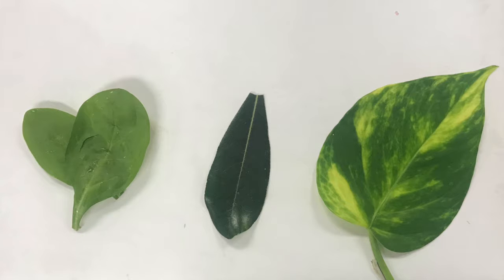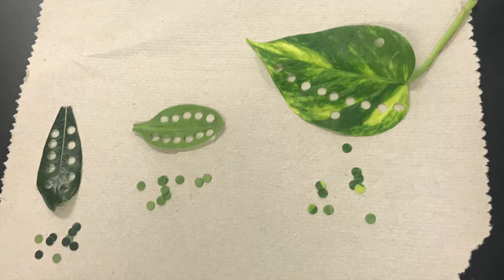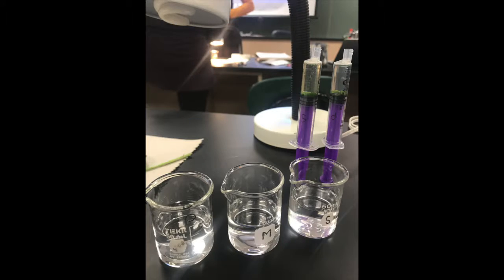Obtain 3 leaves: 1 myrtle leaf, 1 philodendron leaf, and 1 spinach leaf. Next, take a hole punch and punch 10 discs from each leaf. Next, fill 3 beakers with 30 milliliters of sodium bicarbonate.